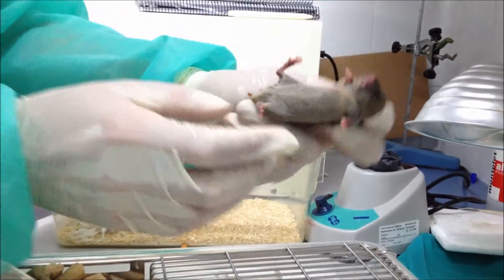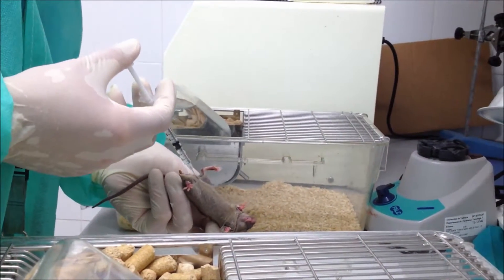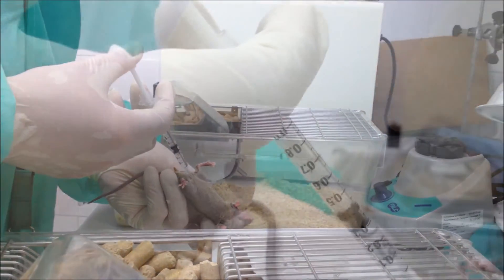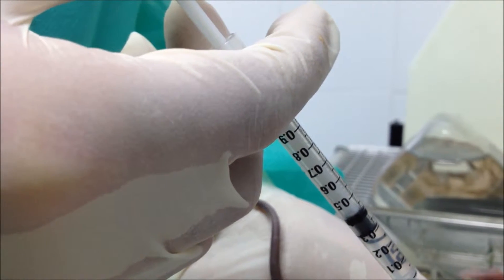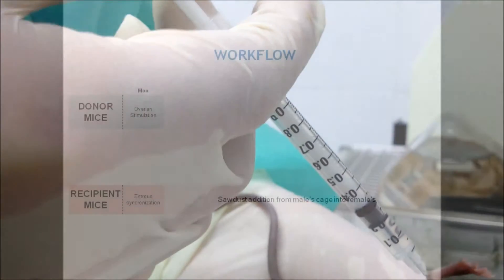Take the female mouse by the tail and the scruff of the neck and hold it in an almost vertical position to displace the organs. Intraperitoneally inject 100 microliters of the pregnant mare serum gonadotropin hormone.